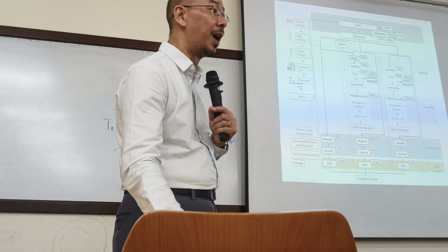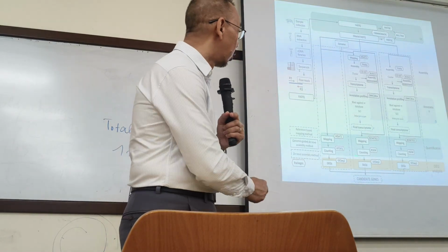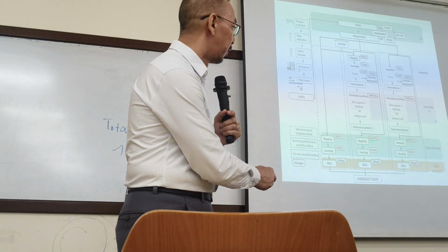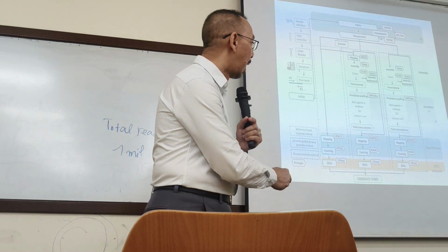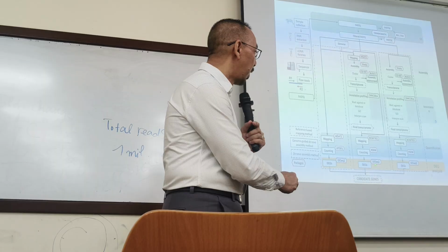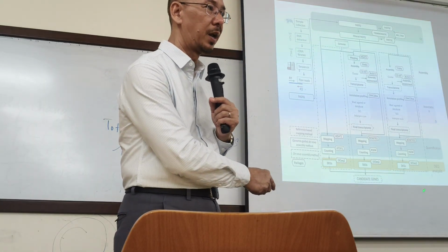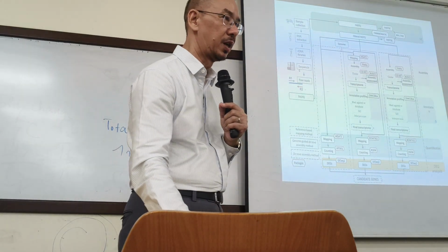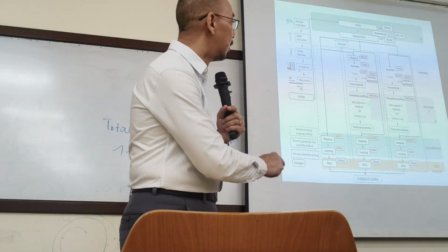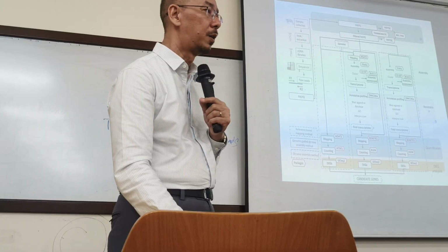In quantification, we use a program for mapping and counting. After counting, we use a tool to identify differentially expressed genes. So two steps here, very simple.